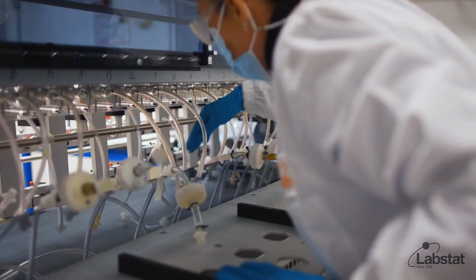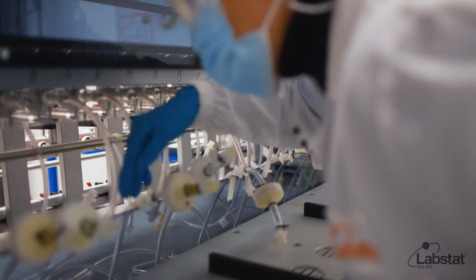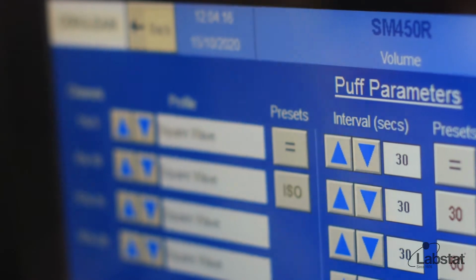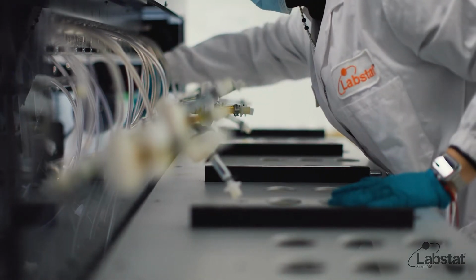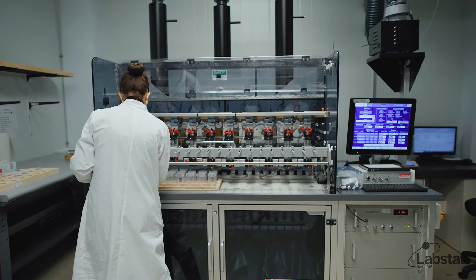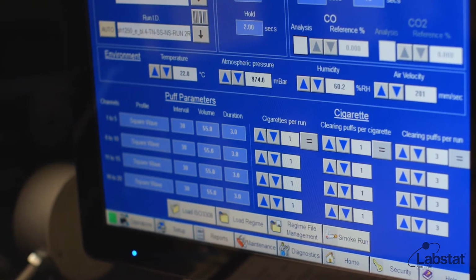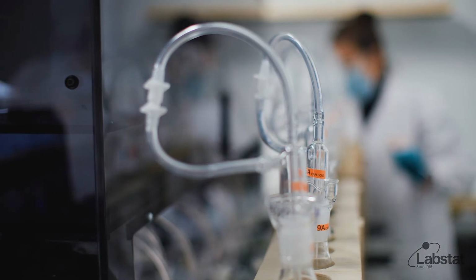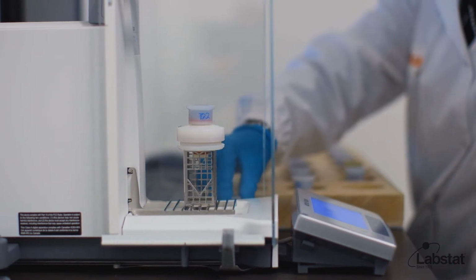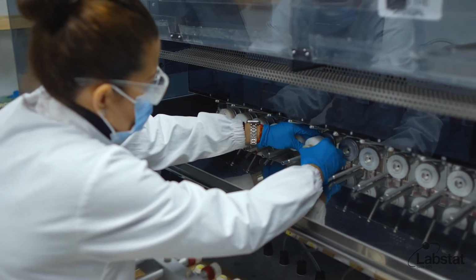The first stage of the testing process is sample generation. This is where we'll collect data to measure whether or not the device is performing as expected under different puffing regimes and throughout its entire life cycle. The emissions from a cannabis vape device are generated using a standard smoking machine designed to accurately control the puff volume, duration, and frequency. This is called the puffing regime. Puffing regimes are not aimed to represent all adult smoking behavior, but rather to create a baseline for regulatory and testing purposes. The emissions collected contain a mix of particles and gases.